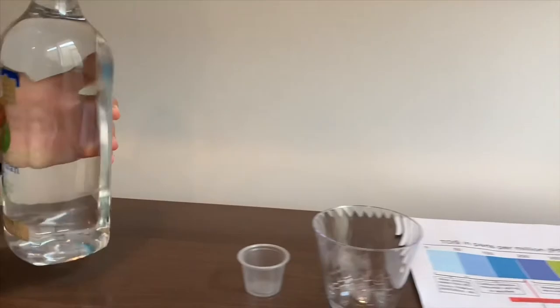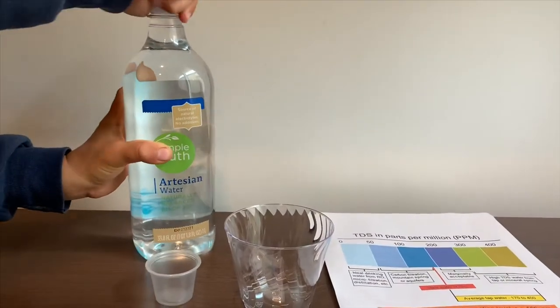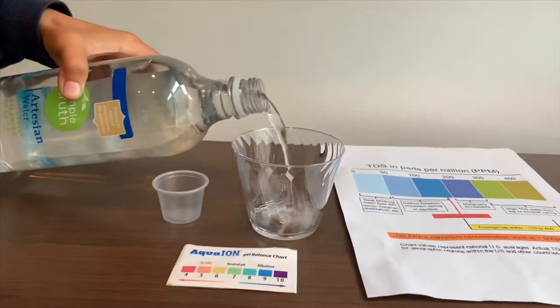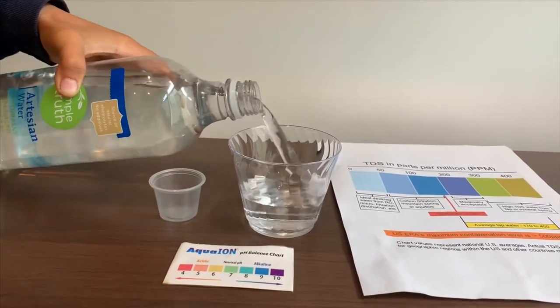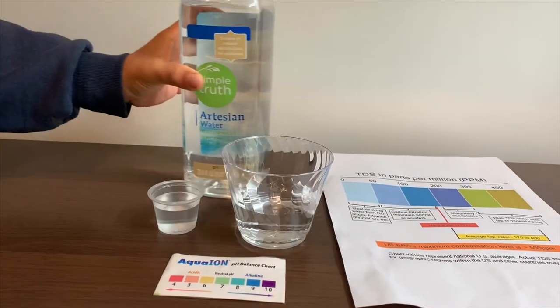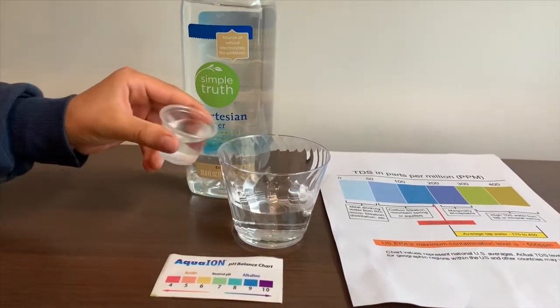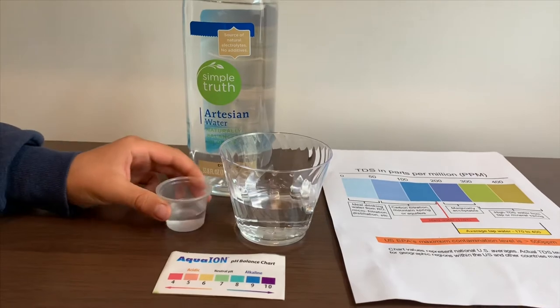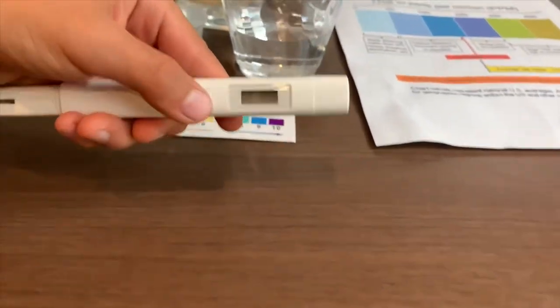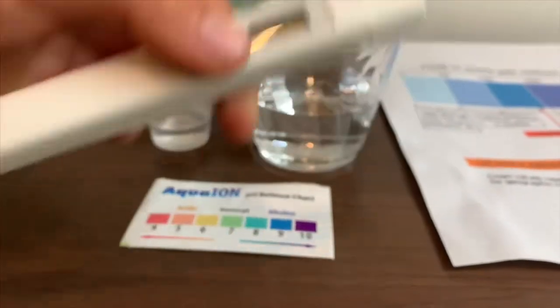Let's pour some water in. This is a little too much for the pH cup, so let's pour some back into the TDS cup. First we're going to test the TDS. Turn on the TDS tester, make sure it says zero, and put it in.